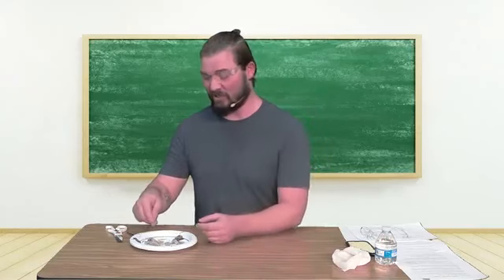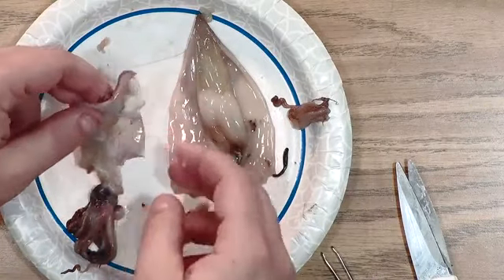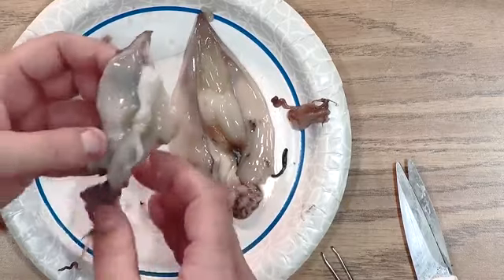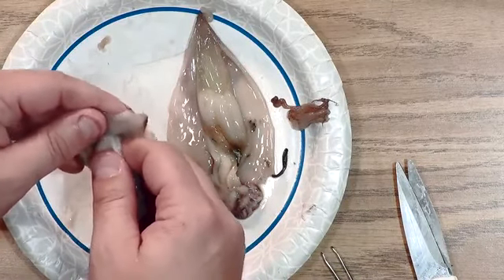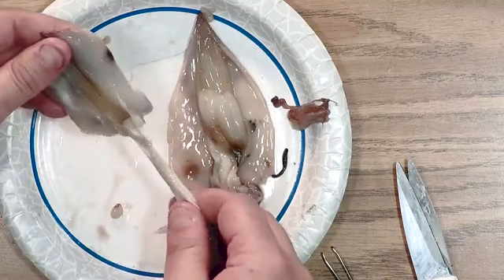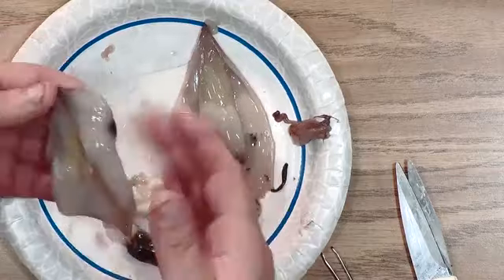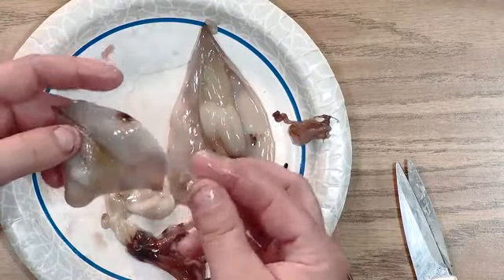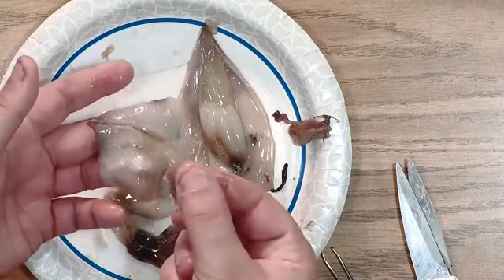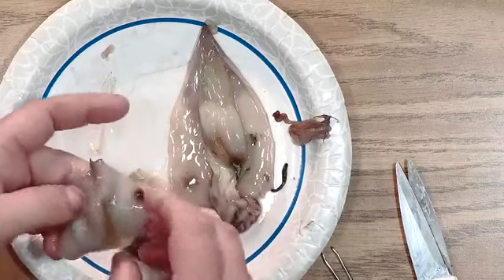All right, so I'm going to zoom back here to this, and I'm not going to be as nice to this because we looked at what we wanted. Now, this is pretty interesting here. I can just separate all of this that quickly. Now I've just taken all that off, and I've got this kite-like mantle. And then when that came off, this other last piece came free. Now this one broke in half, but this is really cool.